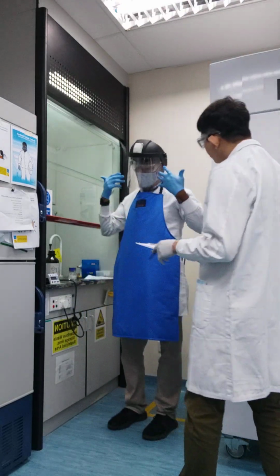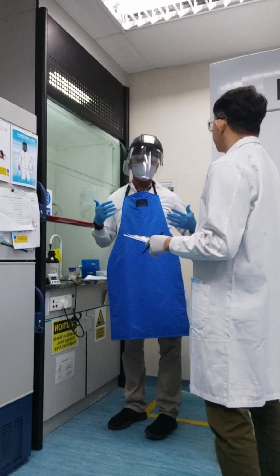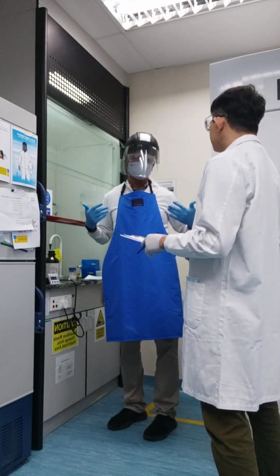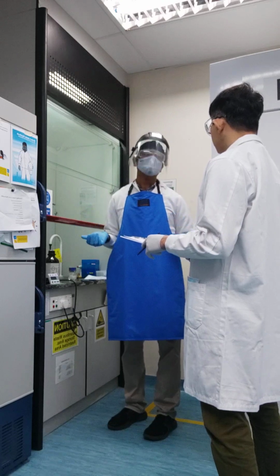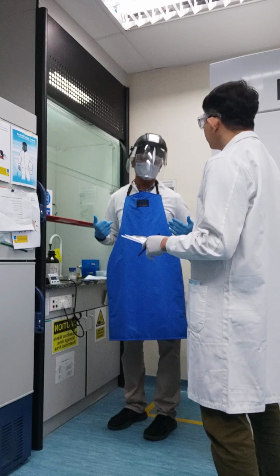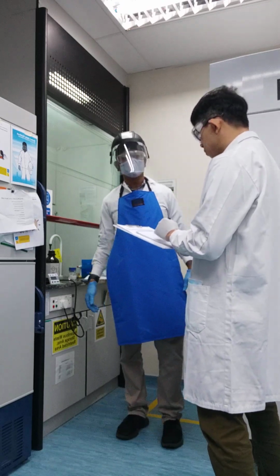So the reason why we are wearing this personal protective equipment in this sequence is to make sure that we protect our body parts correctly from any accidental spills or exposures. And they have to be worn in a sequence. So Chandra, as you get, step 4 is PPE.